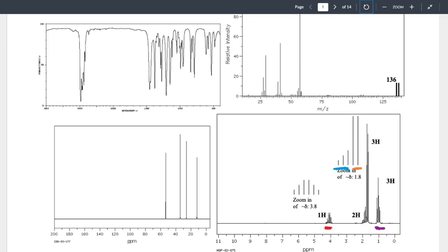Between 0 and 2, good guess, yeah. Okay, it'll probably show up around, officially, about 0.9. You don't need to know the exact value, but about 0.9. So the instrument sees this hydrogen and goes, ta-da, hydrogen. There's a signal.